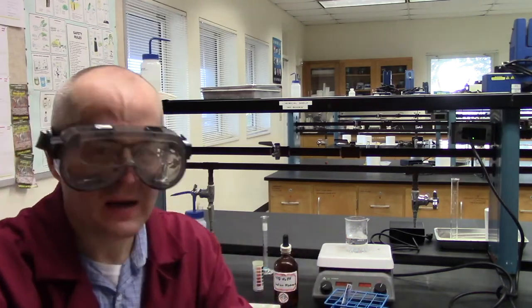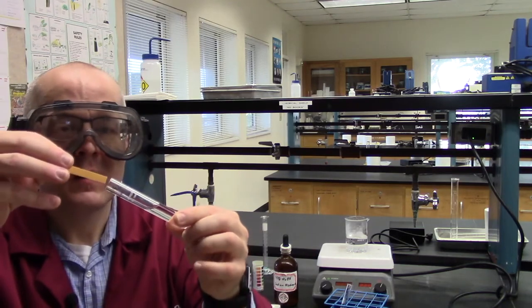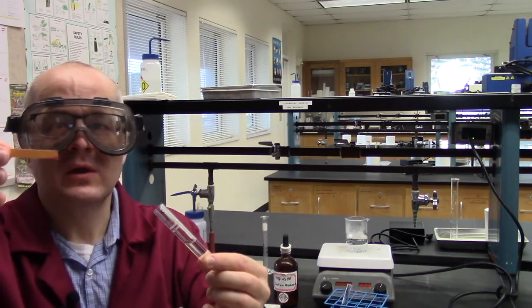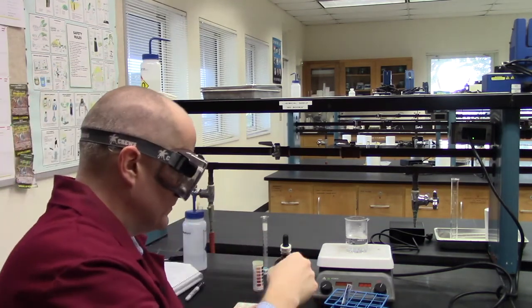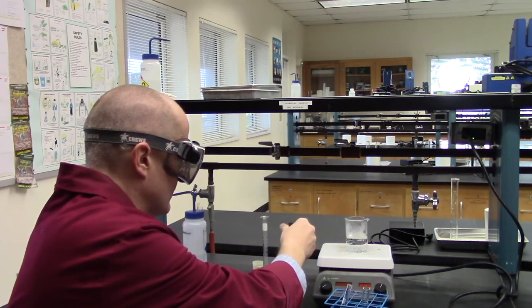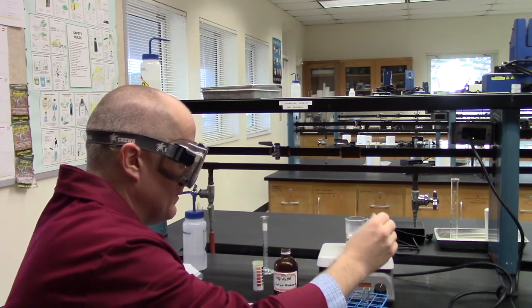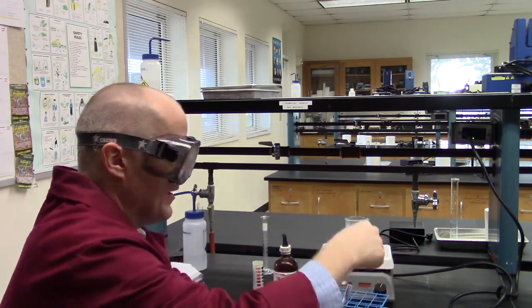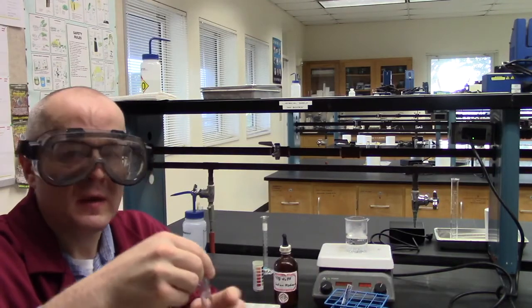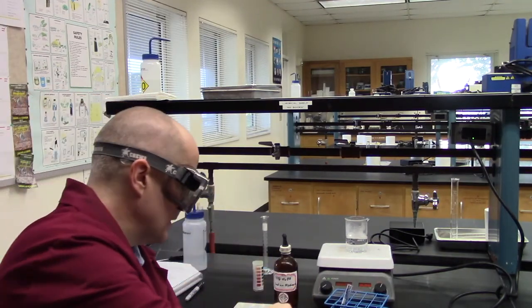So let's try this again. Here we go. Still acidic, so let's add some more. I just added a boatload, about a half mil. I added about a half mil, to be honest with you. I'm going to stir it up a little bit, get it nice and homogeneous.